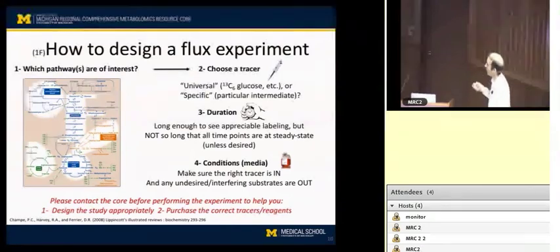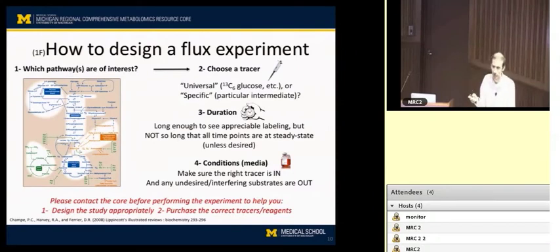Okay, so the gist of all of that is it's impossible to define the right circumstance for every experiment in this type of a setting. You should contact the core before performing your experiment to help you design the study and purchase the right tracers and reagents. Definitely can't emphasize that enough for flux type studies.